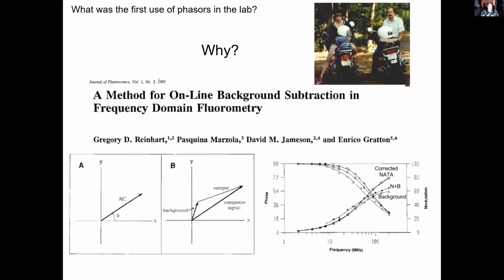Why do this? Well, this gets back to the concept that Enrico can tell you, these time domain, frequency domain wars still continue a bit today. But people doing time domain kept insisting that it was much superior to frequency domain. Well, when we only had one or two modulation frequencies, they had a point. But when Enrico developed the true multi-frequency instrument in the mid-'80s, that was no longer true. But then the time domain people would say, but look, you can't subtract the background like we can.